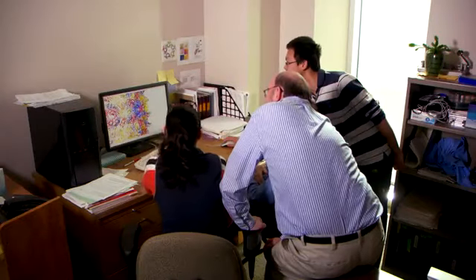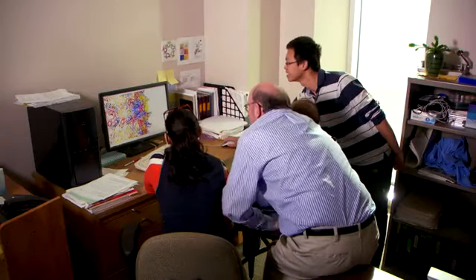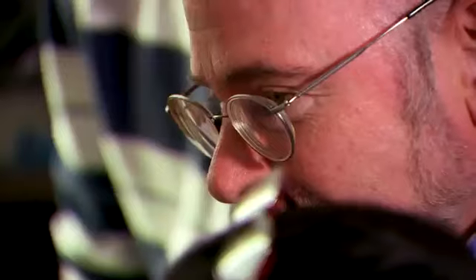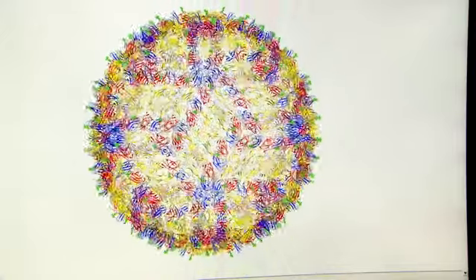So last year, we were the first to report on the structure of Zika virus itself. Since that time, we've been trying to dissect out various features of the virus using cryo-electron microscopy and other tools that we have available here in Hochmeyer Hall. So the work that we did looks at a particular Zika virus antibody.